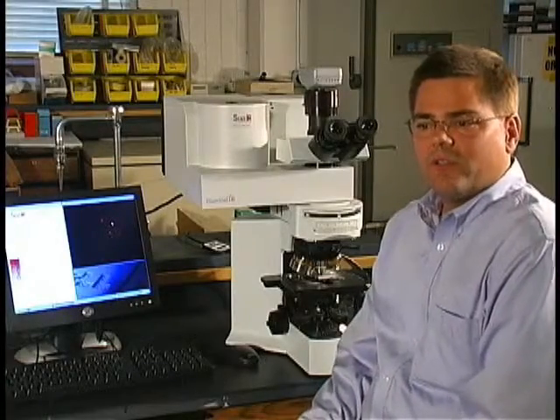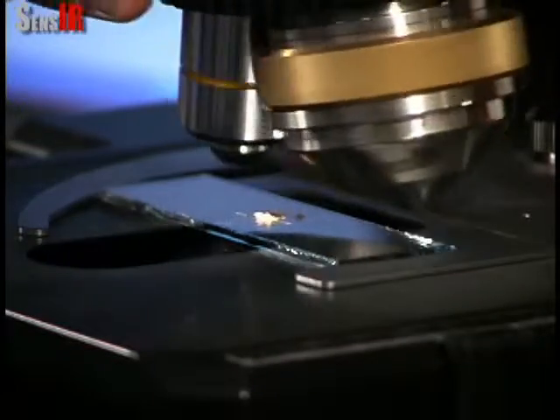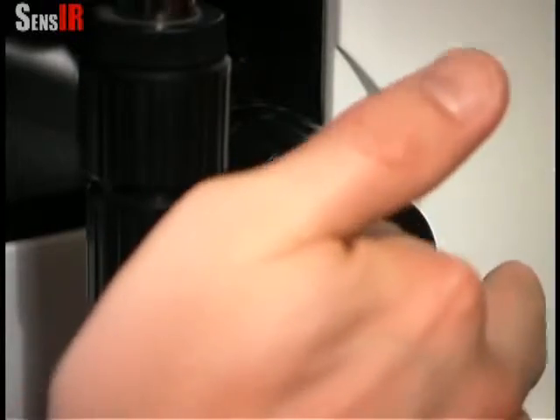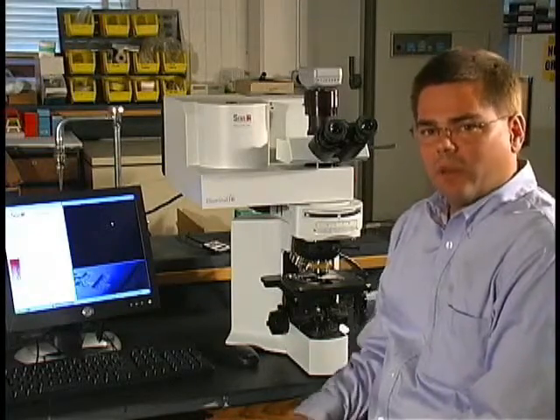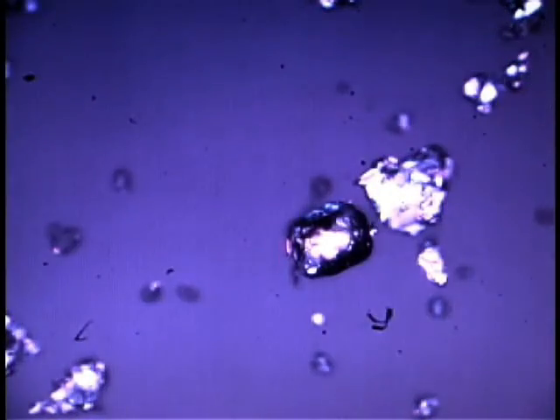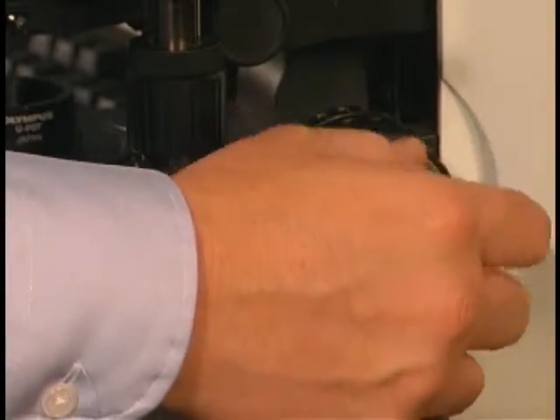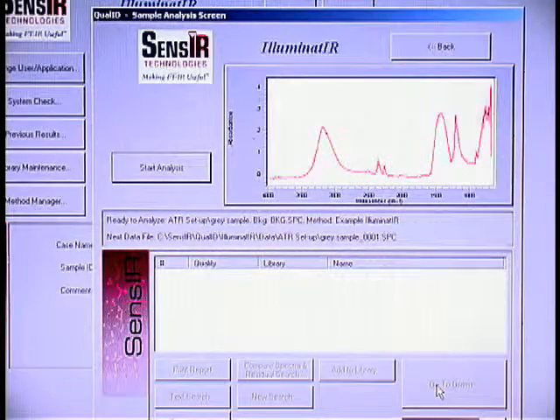What the analyst would then do, after determining that it has two dissimilar particles, would be to center a particle in the field of view, rotate the Diamond ATR into position, raise the sample stage, and collect an infrared spectrum. After analyzing the first species, he would lower the stage, clean the Diamond ATR element, find a different particle, and repeat that analysis — raise the stage, touch it to the diamond sensor, and see the infrared signature. As you have just seen, the combination of FTIR spectroscopy and polarized light microscopy can be used by an analyst to determine the components in a complex mixture in just a matter of a few minutes.